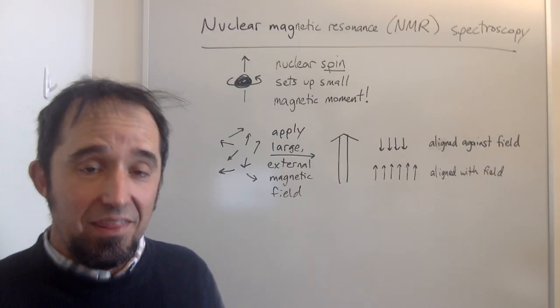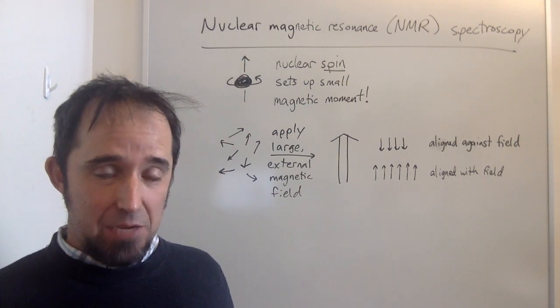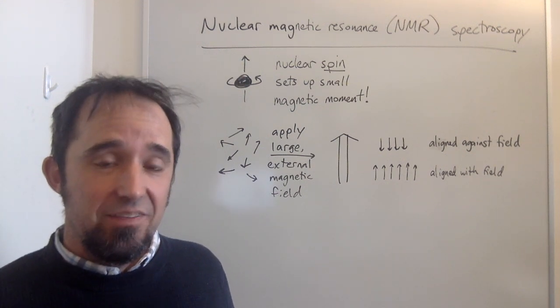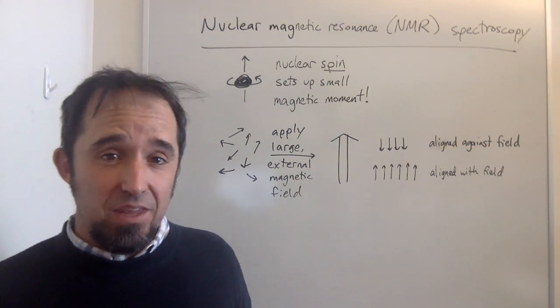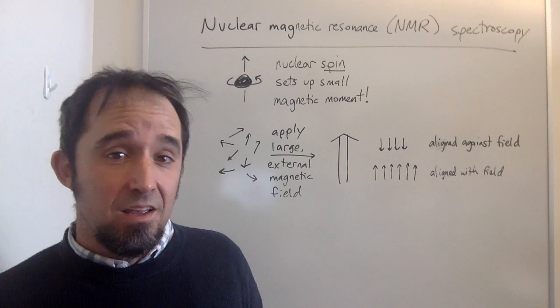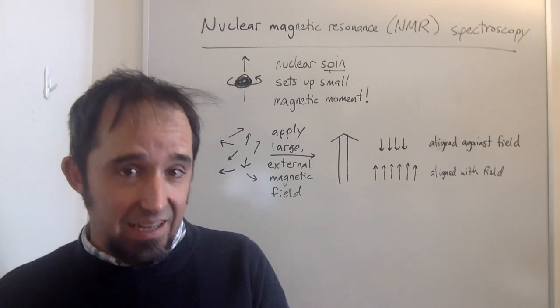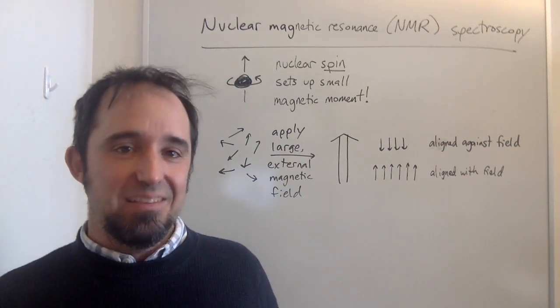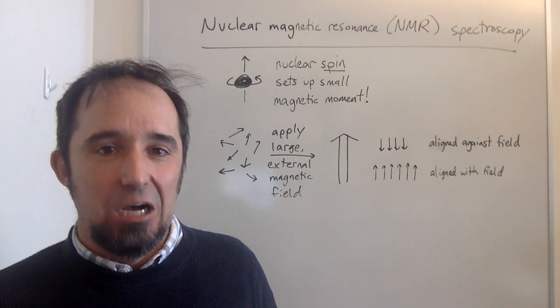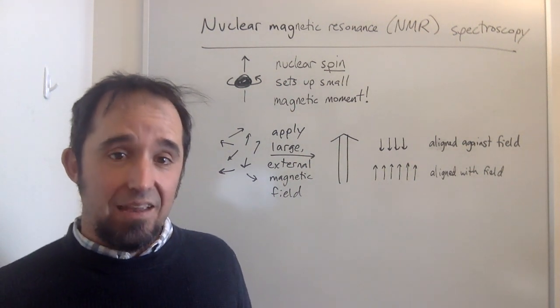In this video, we're going to talk about the most important analytical technique to the organic chemist that cares about structure. And that is NMR, nuclear magnetic resonance spectroscopy. If magnetic resonance sounds familiar, that's because this is also how MRI machines work. That's magnetic resonance imaging. They don't like to say nuclear in a hospital if they don't have to, and so that's why it's an MRI. But the concept is the same, nuclear magnetic resonance.